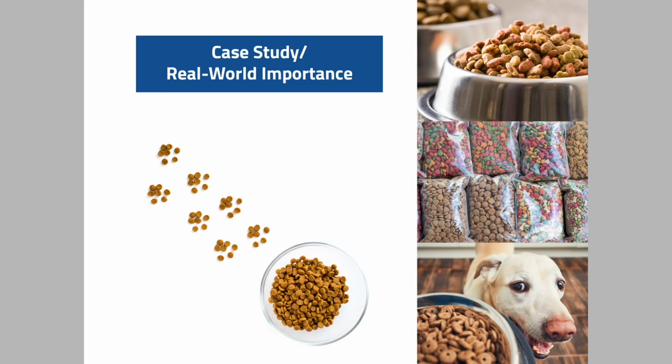And finally, what I'd like to highlight is how all of the components of the QualiT Toolbox can come together to support a total quality program. As some of you may know, in the United States currently, we have experienced the death of between 70 and 100 dogs as a result of aflatoxin getting into a pet food that was released into the market. I want to emphasize that this is not concerning that specific company. Unfortunately, over the last 20+ years, many times we have seen aflatoxin enter the market in pet food.